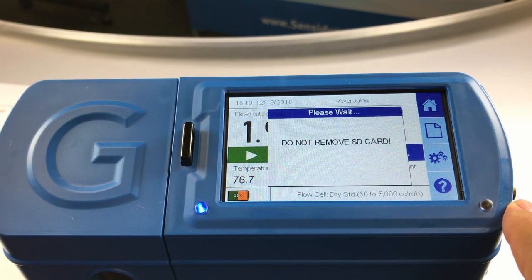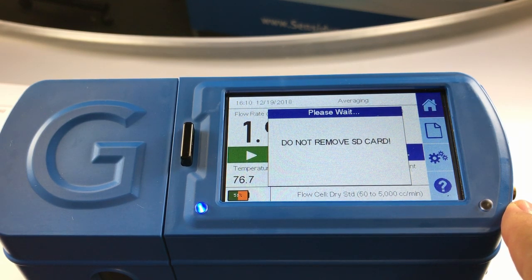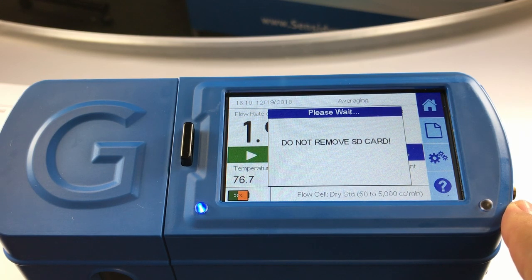Note: if automatic save to SD card mode is turned on, the file will save to the SD card. If the file name already exists, a window would appear asking if the sample set should be saved as a post-cal report.